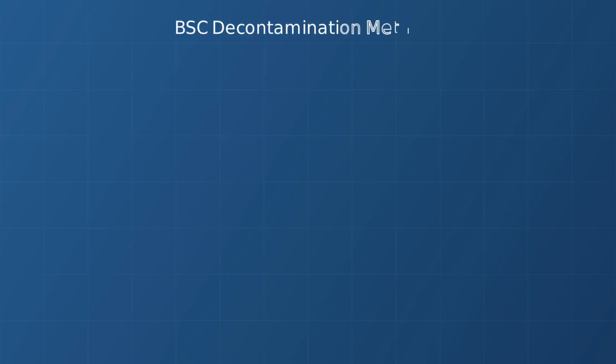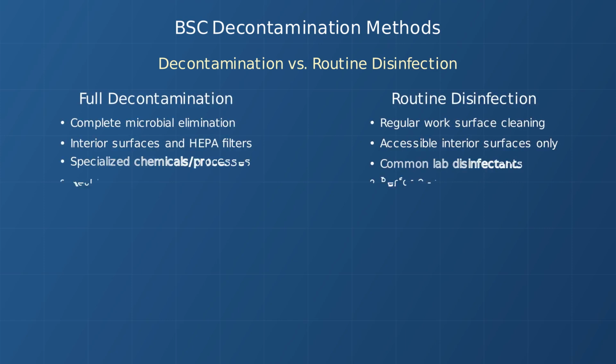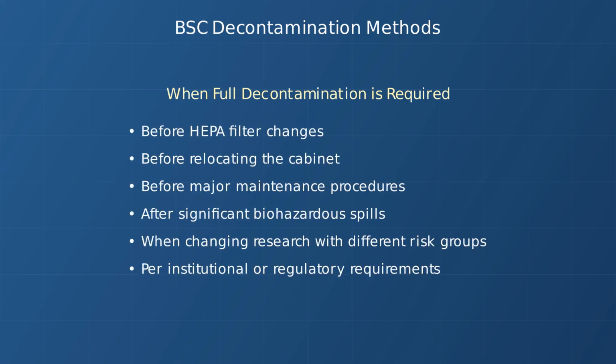Biosafety cabinet decontamination differs significantly from routine disinfection. Full decontamination aims to completely eliminate all microorganisms from all BSC surfaces, including HEPA filters, while routine disinfection only addresses accessible work surfaces. Full decontamination of a biosafety cabinet is necessary in several specific situations.